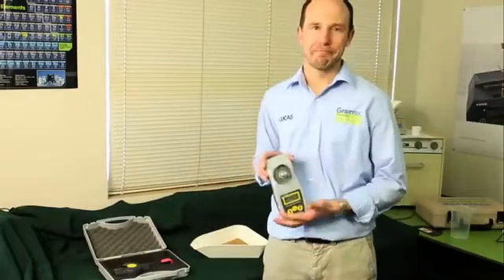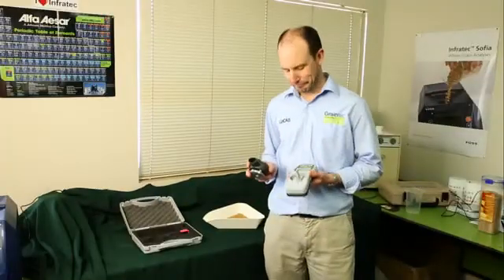Hi, this is the HE Light Moisture Meter. It's really easy to use, let me show you how.